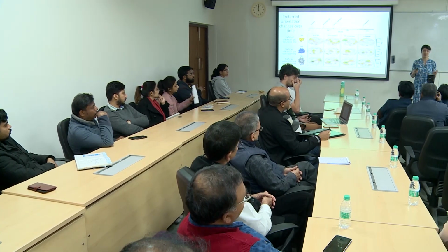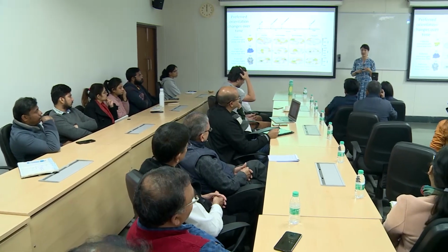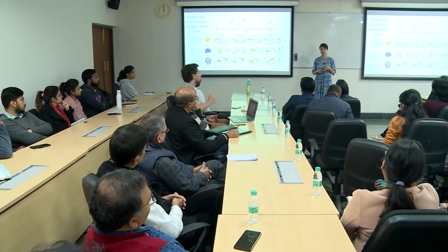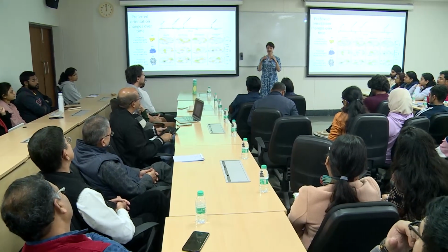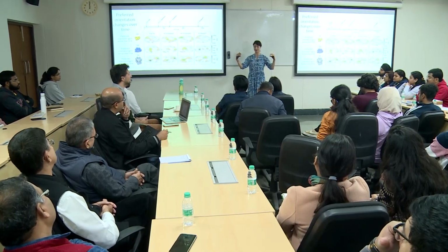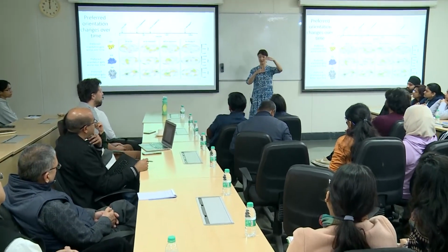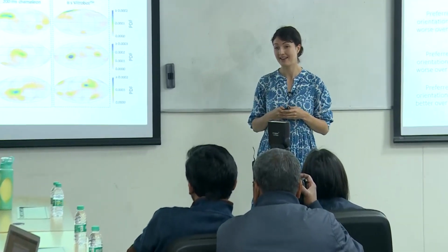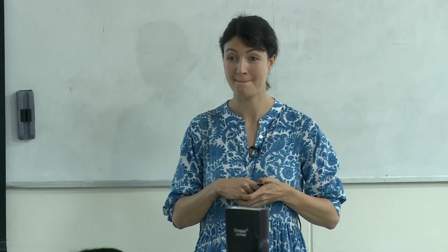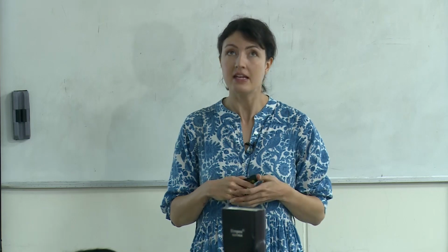Yeah, absolutely. And there are almost certainly buffer composition, salt concentration as well, and anything else which impacts viscosity. Essentially anything which impacts the fluid dynamics of your thin film formation or the air-water interface itself is potentially going to have an impact. So in other words, if I can predict the air-water interface interaction of the protein, I should be able to predict what will go inside.